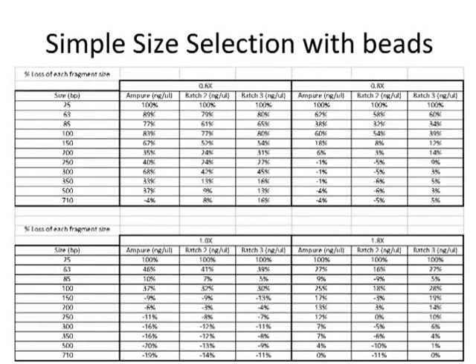So with that, I wanted to finish off with a couple things on where I think the automation is really key for any number of samples, regardless of what you're starting with. Whether people in my lab are prepping 6 samples or 600 samples, the purification steps are always done on deck, for the reasons you'll see here. The first is that simply changing the ratio of bead solution to sample solution, you can see a fairly crude size selection.